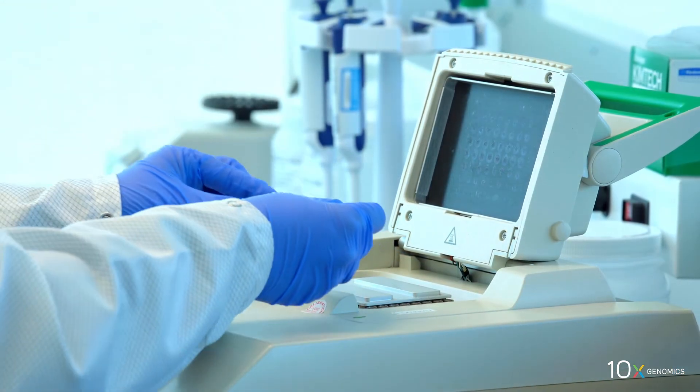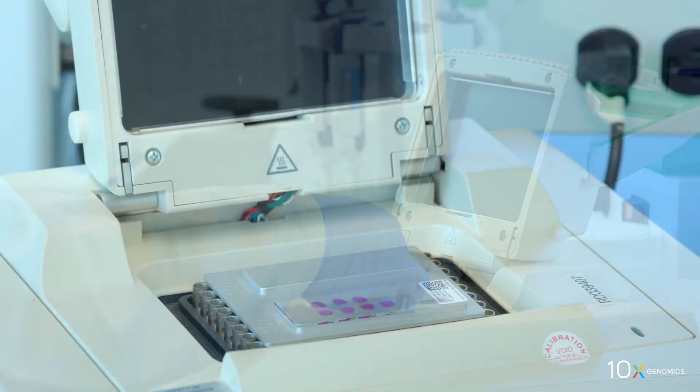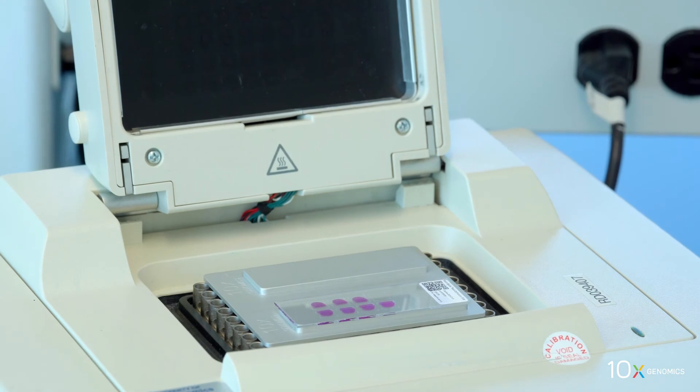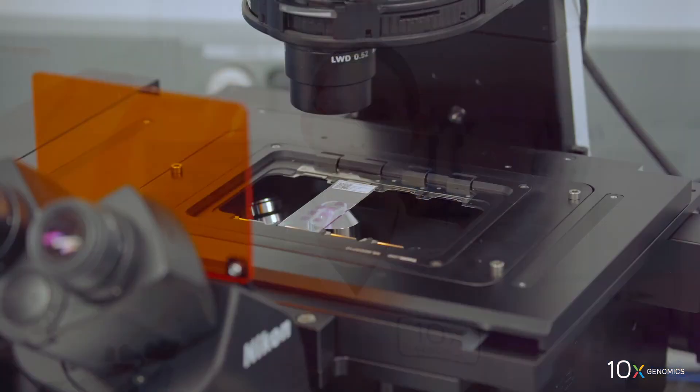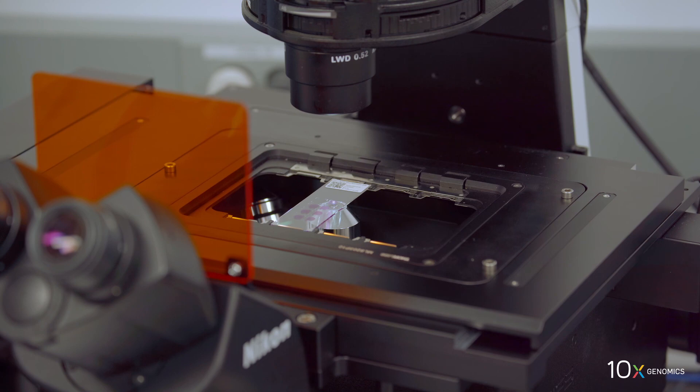Incubate the slide on a thermal cycler adapter with the thermal cycler lid open for five minutes at 37 degrees Celsius. We have completed tissue staining. Next, we will image the tissue with brightfield settings.